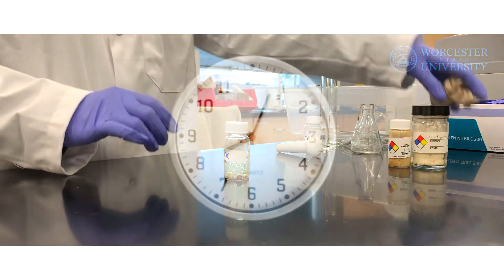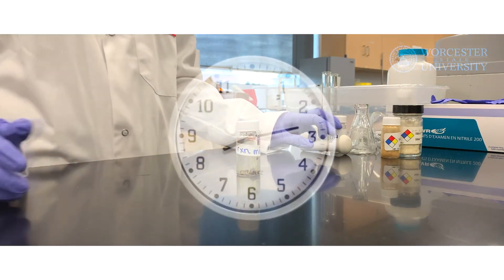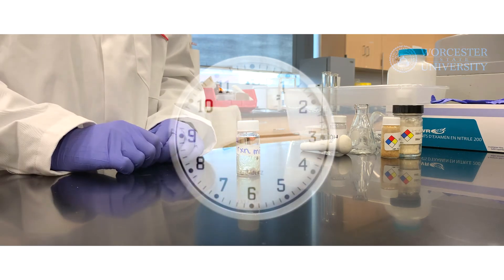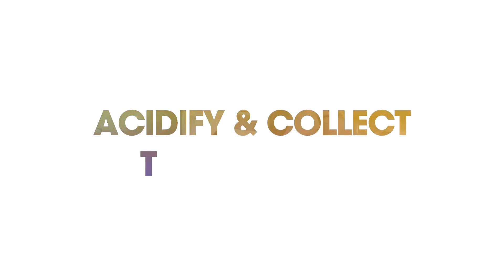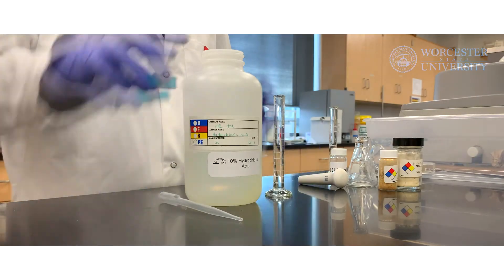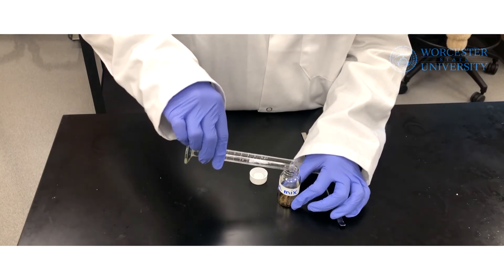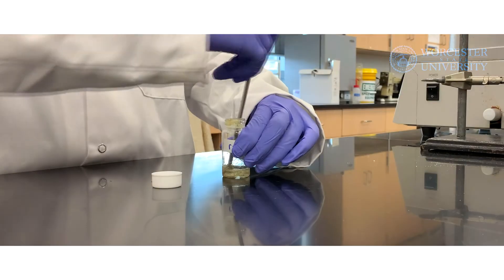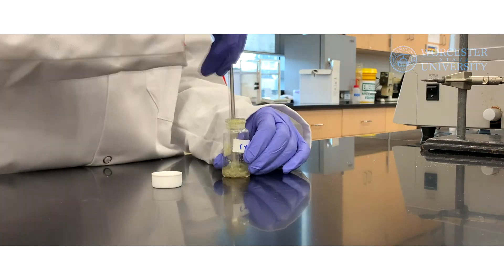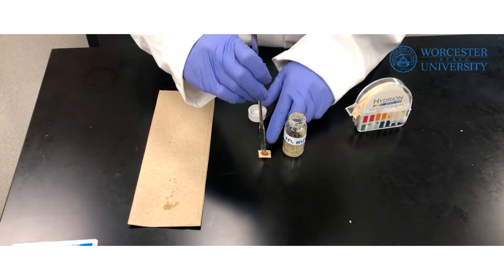Let the mixture sit for 15 minutes. After the 15 minutes, add 2 milliliters of 10% aqueous hydrochloric acid to neutralize and further acidify the reaction mixture. Check the pH of the solution to make sure that it is acidic.